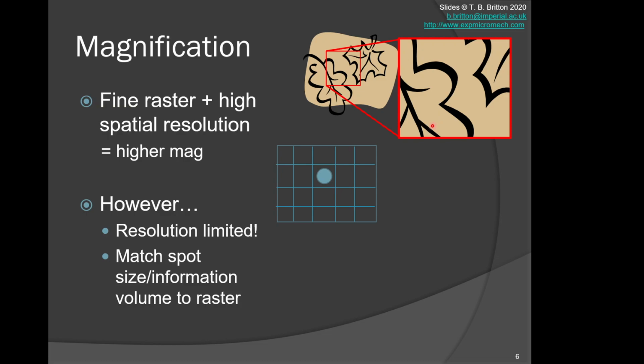The magnification is subtly different. For instance, you could imagine the magnification, the physical feature size to the observed feature size, to be different depending on whether you're watching this video on a mobile phone or on a full laptop screen. So you've got to be slightly careful about what that magnification number means. What we like to think of more precisely is the characteristic resolution of the technique, i.e. how can I tell the difference between a signal at point A and point B? We'll discuss that in more detail shortly. Broadly speaking, this is of the order of 1 to 2 nanometers for most modern electron microscopes.